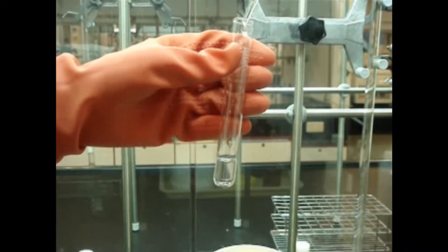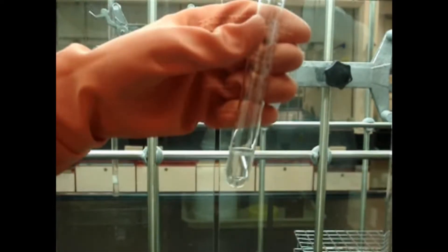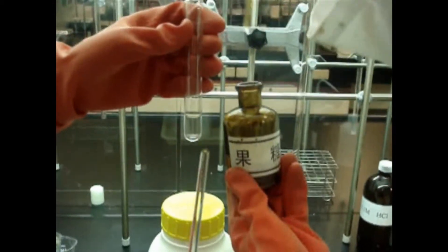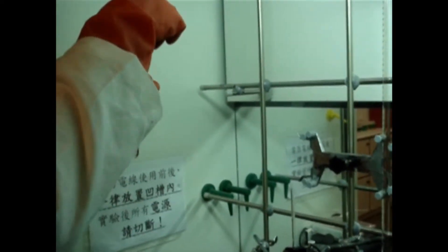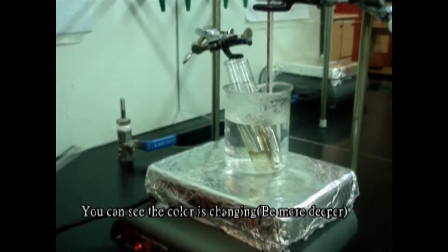One more drop. OK. Now it's completely disappeared. And we add sugar — two drops. After all, we put it into boiling water.